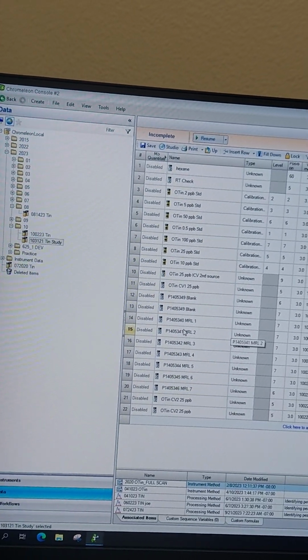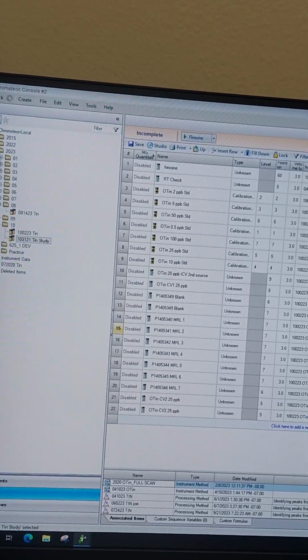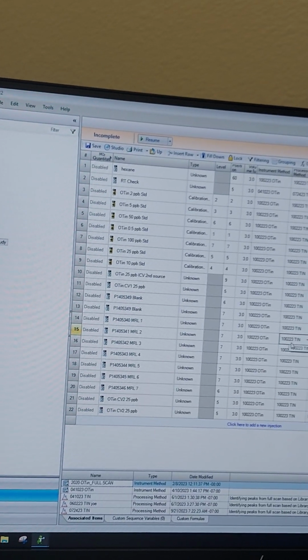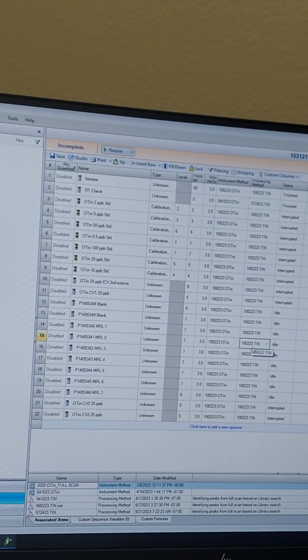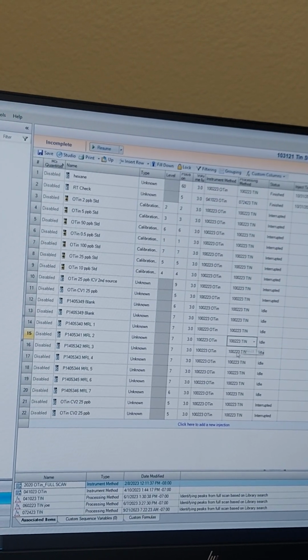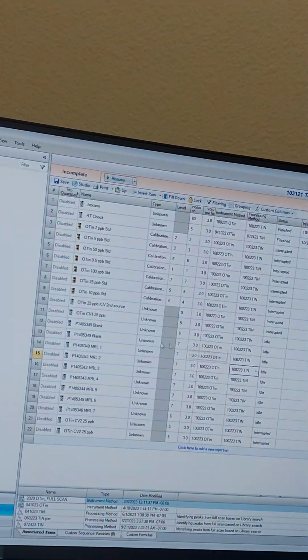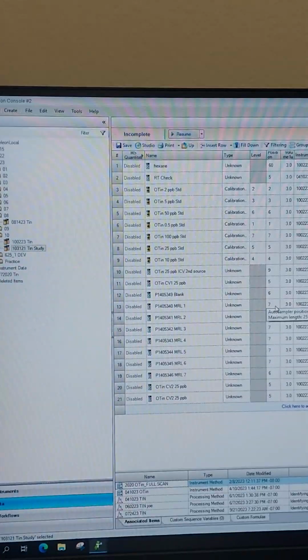Like we'll go into the data after it runs, and then we might have to change which internal standards are used for some samples, and that will change the processing method, and then we'll save it as a new processing method. And this position is the position that is here. So this was the one I copied. So we'll put these in.